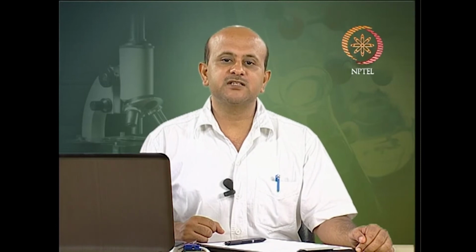Now, electrospray ionization or ESI. A more physical explanation of ESI is that needle voltage produces an electrical gradient on the fluid which separates the charge at the surface. This forces the liquid to emerge from the needle as a cone. The tip of the cone protrudes as a filament until the liquid reaches the Rayleigh limit, where the surface tension and electrostatic repulsions are equal and the highly charged droplets leave the filament. So, that is one way, that is kind of spray.